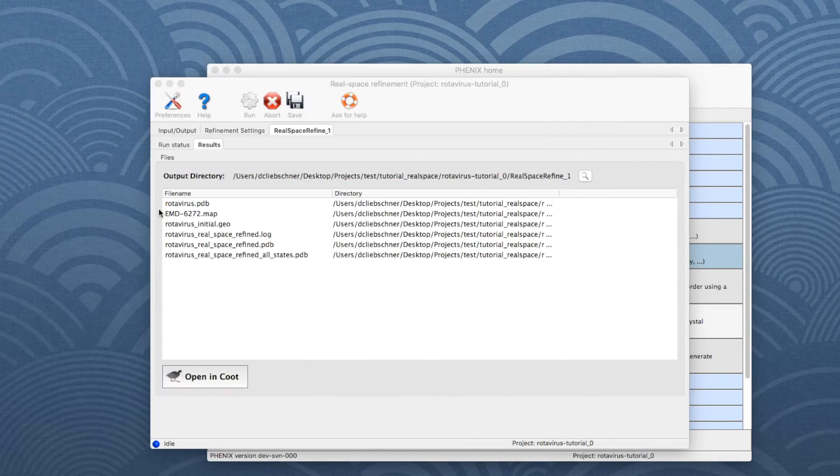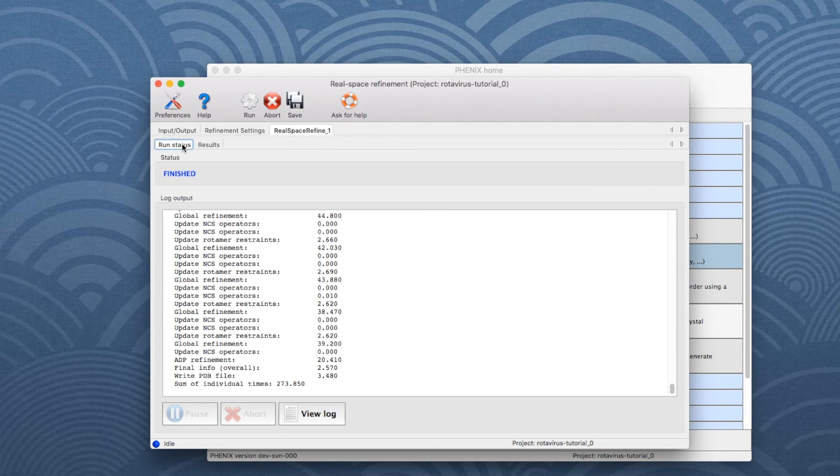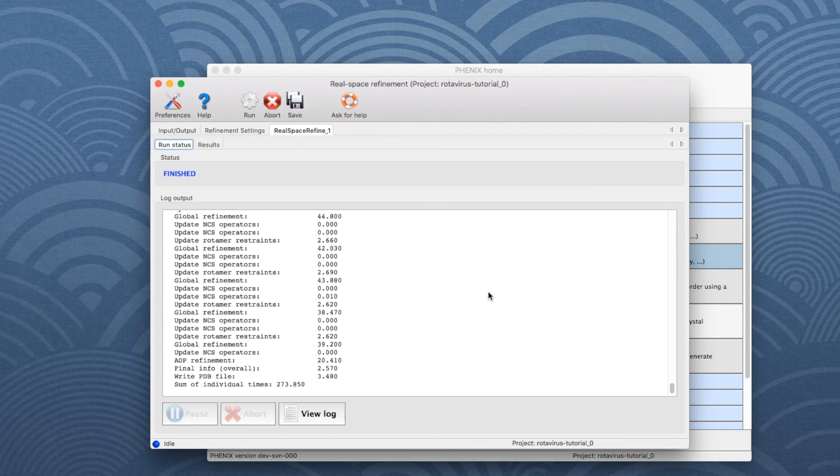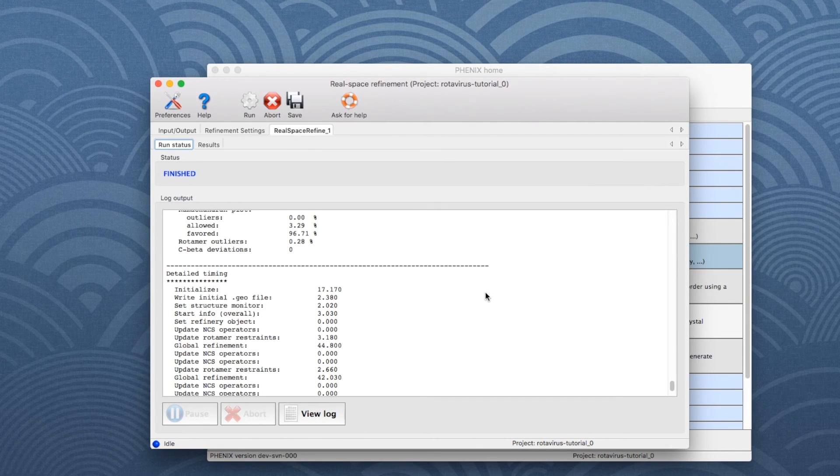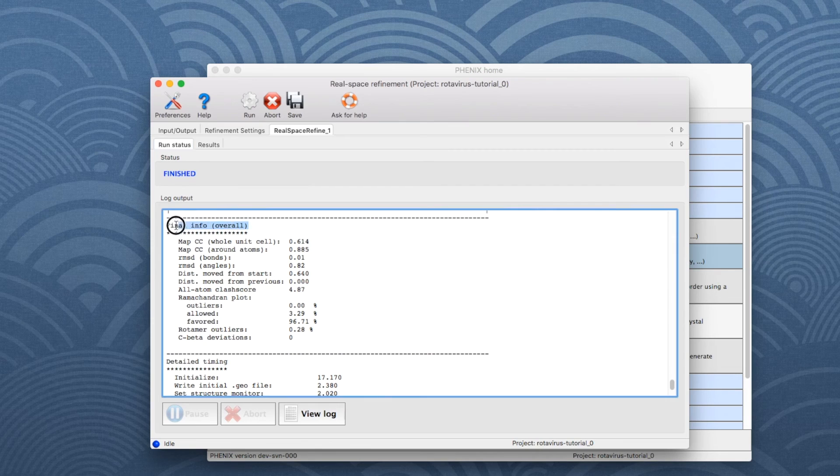To see the overall results of the refinement job, go back to Run Status. Stroll up the log file a bit to find the table called Final Info.